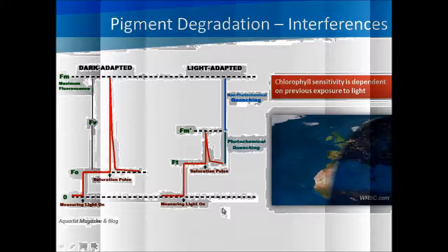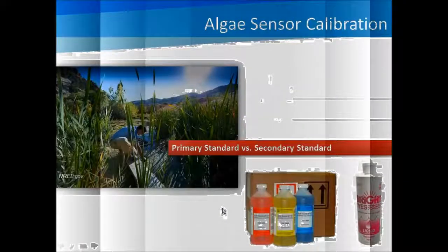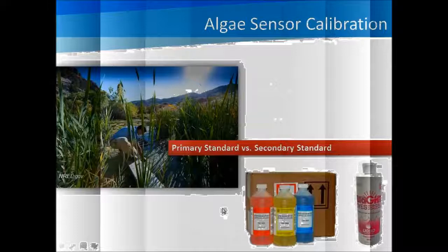So as I mentioned, calibration is a topic we get many questions about, so I'll go ahead and pass it back to Tim for an overview. All right, I want to go through two different approaches to calibrating these sensors, and I think this will apply partially to the question about using it versus continuous and spot sampling.